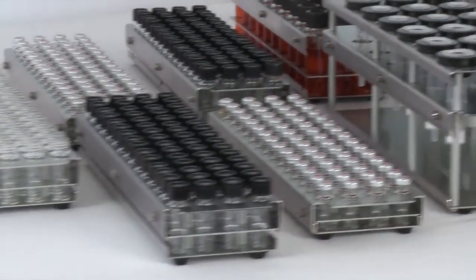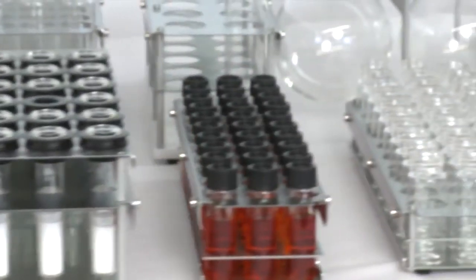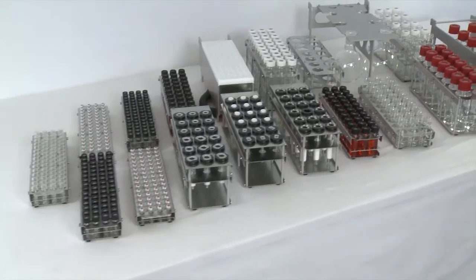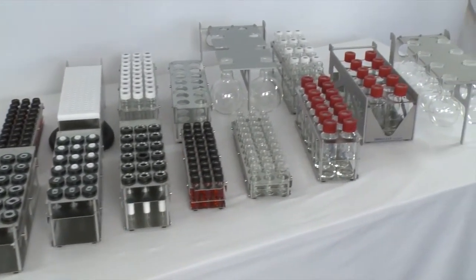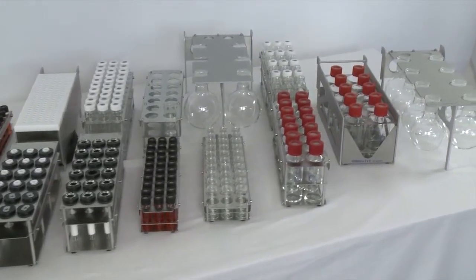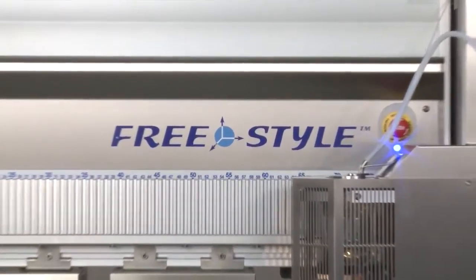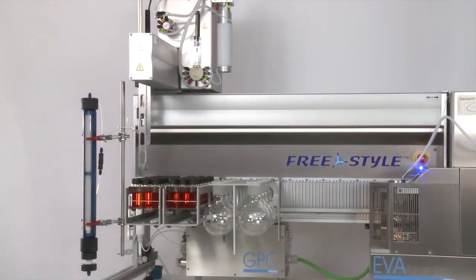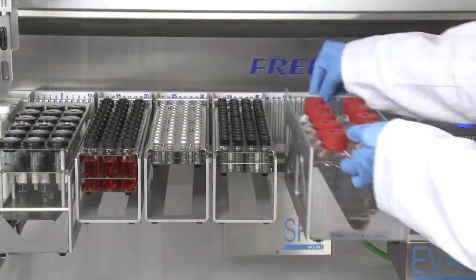More than 40 different racks can be freely combined in the FREESTYLE system at any time, each rack with different sample containers. Depending on the actual load, up to 180 samples can be automatically processed in one go using only one platform. Some competitors advertise 50 or more platforms. FREESTYLE has got only one on which you can freely combine all racks available.